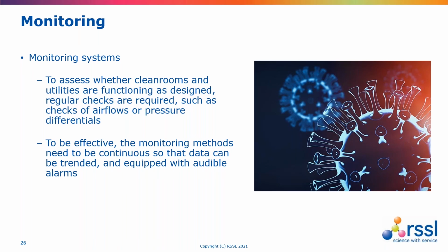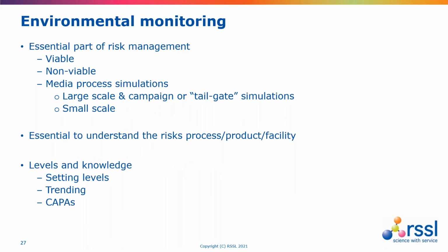And that's also in keeping with the process analytical technology approach, which there's quite a bit of FDA literature on, the PAT approach. We touched on environmental monitoring and how this needs to fundamentally relate to the contamination control strategy, because it's the final check of the suitability of controls.